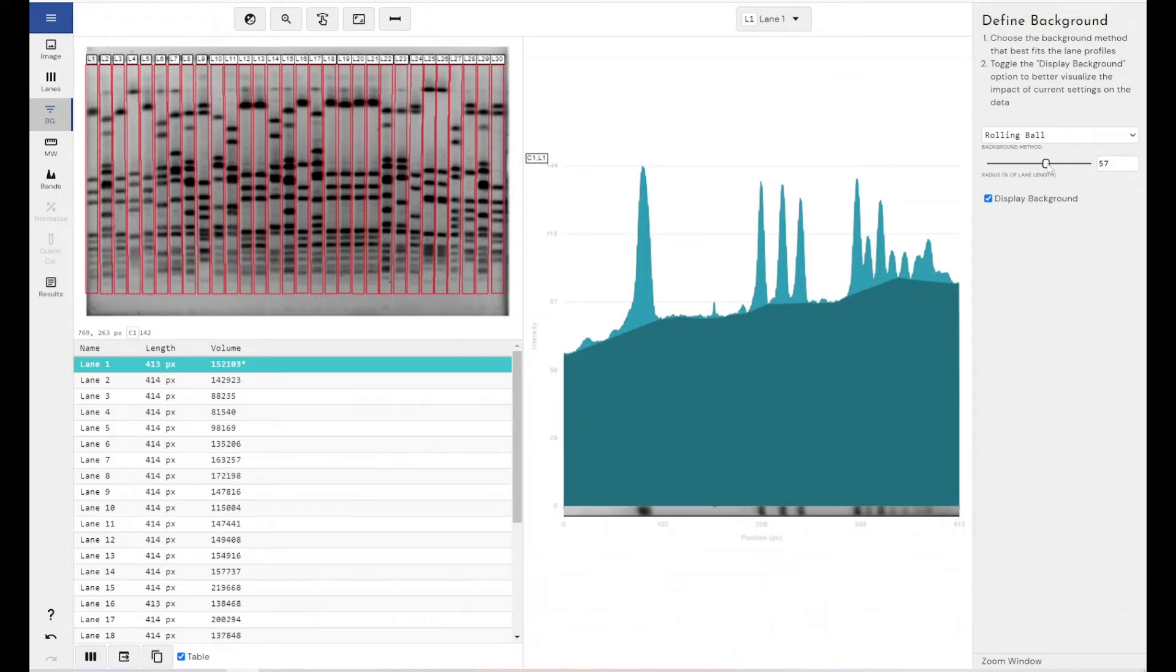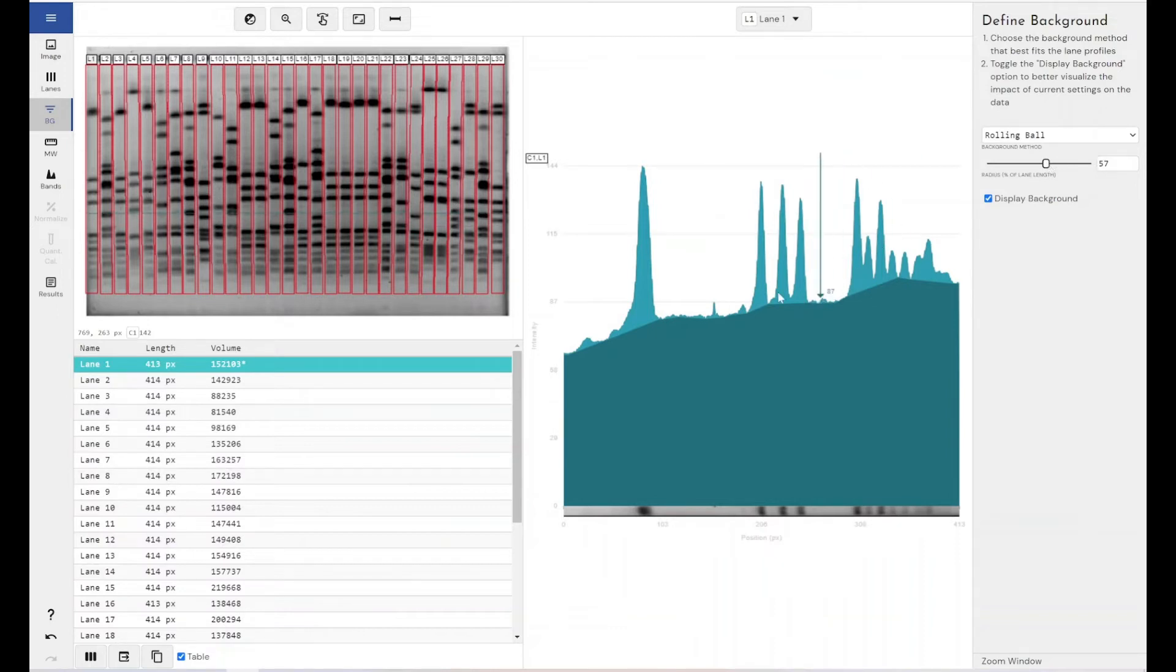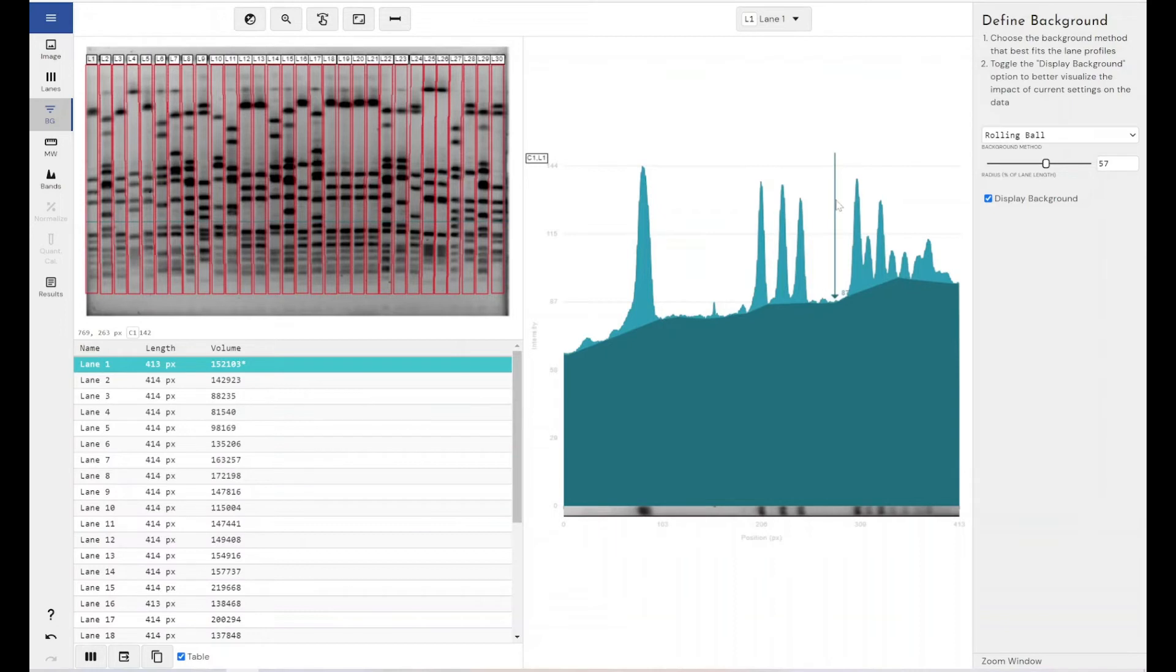And in most cases, we would suggest rolling ball is the method you want to use, because it adapts to changing levels of background as you move along your lane profile. There's a certain level of flexibility built into it.